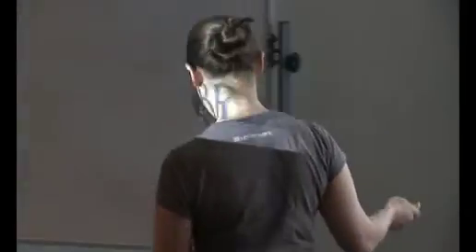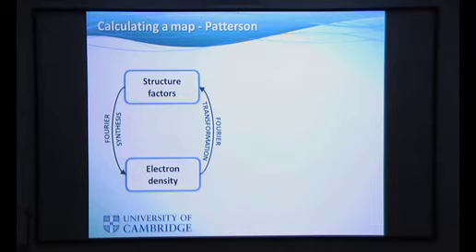And they said there has to be a rabbit, therefore. So between the structure factors and the electron density, there is Fourier. If we look at the structure factors closely, we have now seen they're actually amplitudes and phases. And if we generalize, we would say we just get a map.